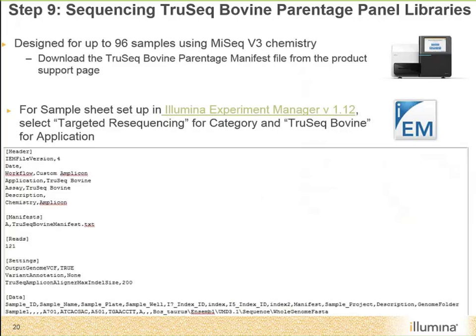Here I have an example of what the sample sheet should look like. I know it's quite small, but you have the slides. It's a nice way to double check that your sample sheet is set up correctly. And one thing to keep in mind, this is a 1 by 121 run with 2 index reads.